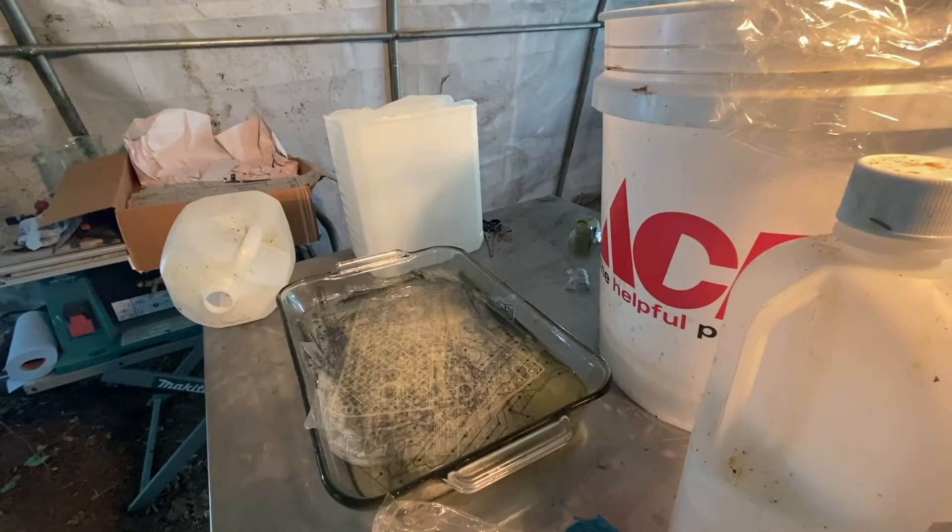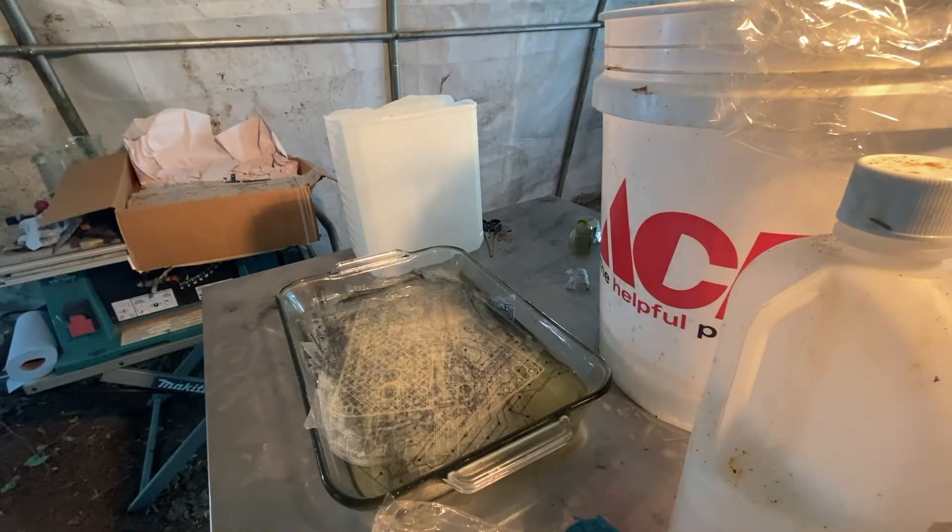All right, so I'm just gonna pluck all these out, put them in that container there to drain a little bit. That way I'm not just spilling nitric acid all over the place. This way most of it can drain, then I can actually rinse the rest of it. Putting gloves on, because that burns your skin if you get it on you. And it's really easy for it to splash when it's like this.